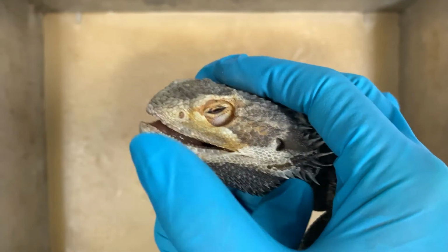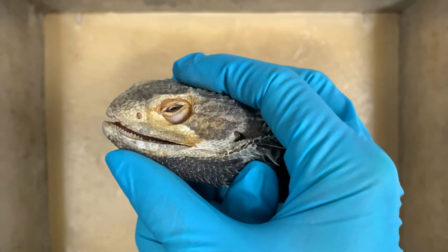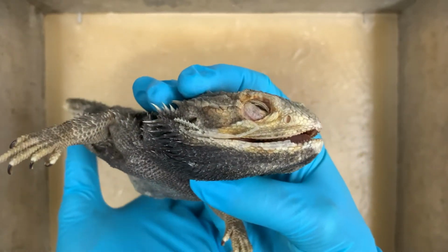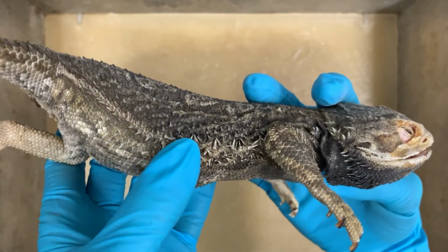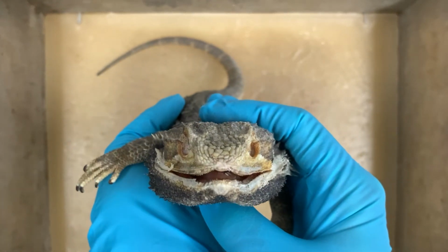Unlike the geckos, which have pleurodont dentition, agamids are acrodont. That means that their teeth sit on top of the jawbone, not along its lingual margin. Notice also that, unlike the geckos we have seen, the bearded dragon has full eyelids. The spines on the head and flanks of bearded dragons are specialized scales.